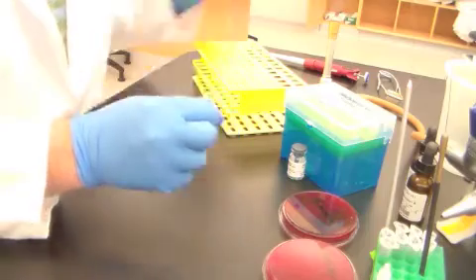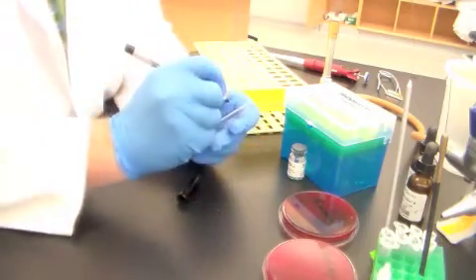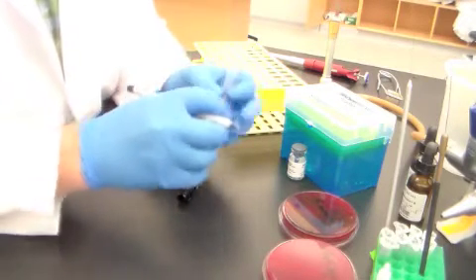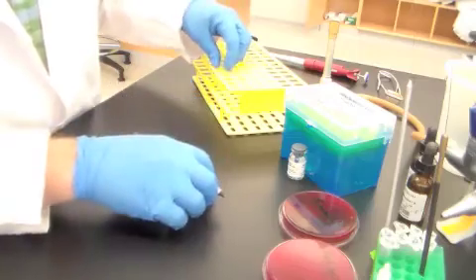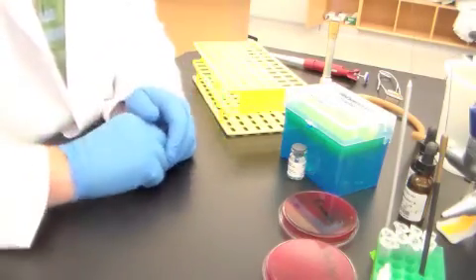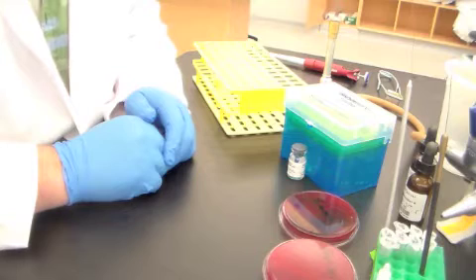Then it's also very important that you label which one is which, because you'll be doing 3 different species. Then what you're going to do is, once all 3 of them are done, you're going to put them into a 37-degree water bath that is set up on the bench in the laboratory, and check them after an hour.